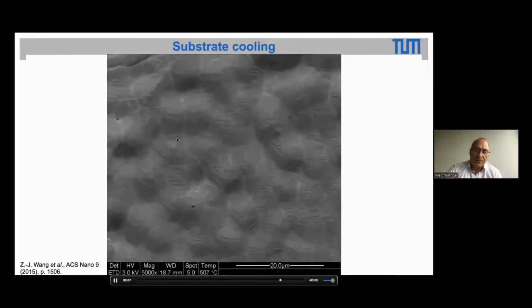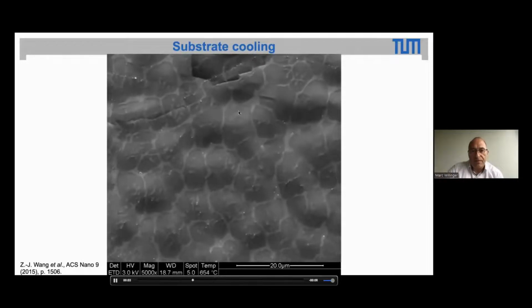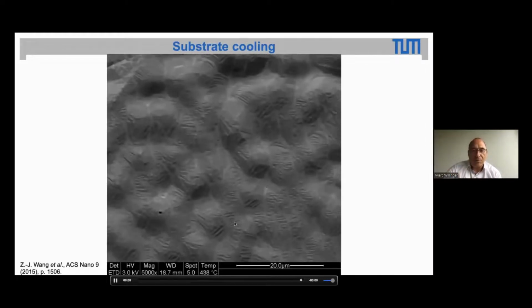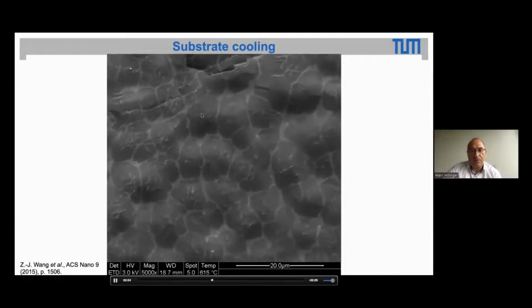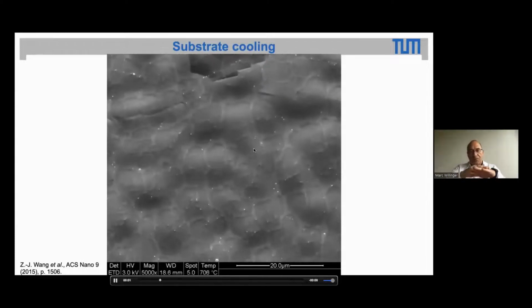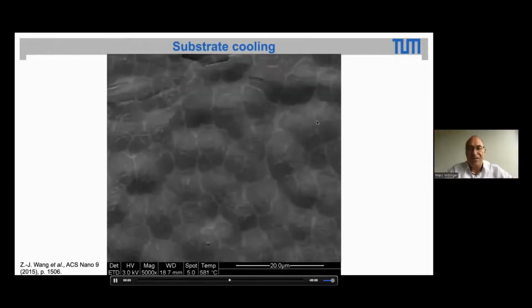This is because of this effect of oxygen that is still in the chamber. So when you cool down, you get all this step formation. And that is also nice because if you don't see when this happens, you don't really know when and why it happens. But if we compare graphene grown in literature, you see that often the graphene has grown on some kind of stepped surface, but in fact, it was not growing on a stepped surface. The stepped surface formed during cooling.